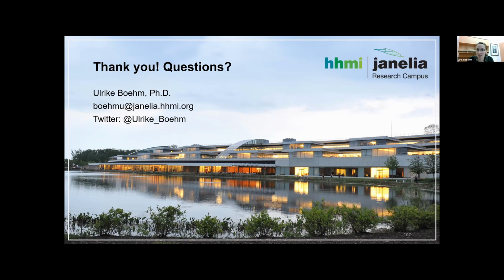And lots of fluorophores cannot really handle these blue wavelengths. I think back to when I did my PhD, we tried to do activation with a 405 laser, and after a few slides this was all gone, and then we changed this to 2-photon excitation. So we doubled the wavelengths, and therefore you actually have a way broader spot. But in the end, that was way nicer for the fluorophore.